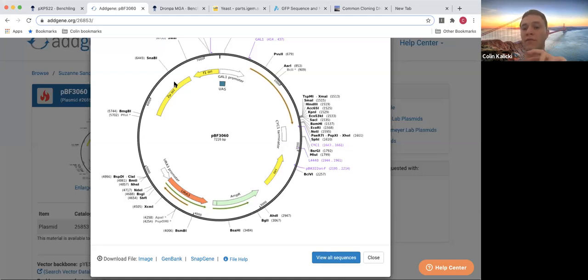Origin sites are specified for the species. So let's say maybe this one's for one kind of yeast species, like baker's yeast. And then you have other types of yeast species, so you're going to have a different origin site. And then this one would probably be for bacteria, just based on the labeling. So each origin site is based on the species you want to clone it into. Cloning, just as it sounds, is just repeating it over and over again. When I first was learning this, I was kind of silly and I was like, oh, what does cloning mean? But that's all it is. It's just repeating it over and over again, or just inserting it into its DNA so it can get repeated.